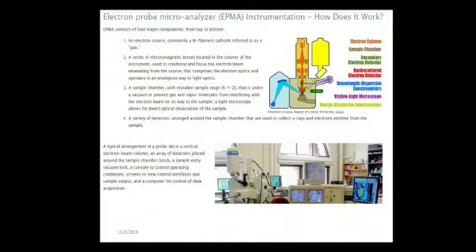An electron microprobe operates on the principle that a solid material is bombarded by an accelerated and focused electron beam. The incident electron beam has sufficient energy to liberate both matter and energy from the sample. These electron-sample interactions mainly liberate heat, but they also yield both secondary electrons and X-rays.